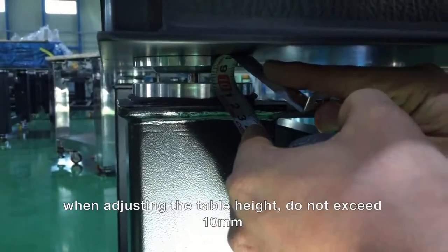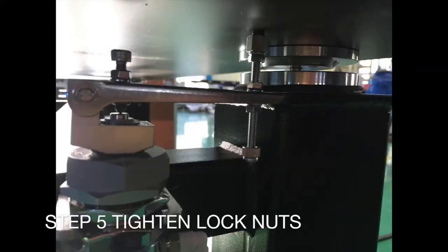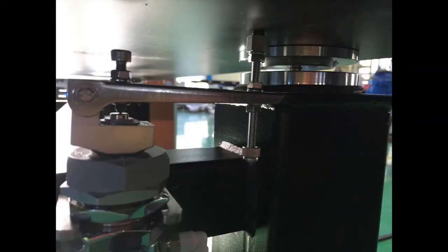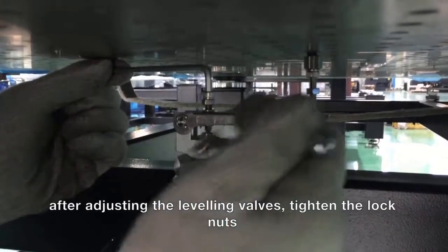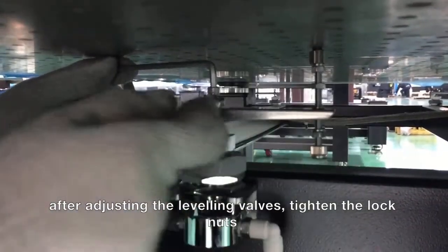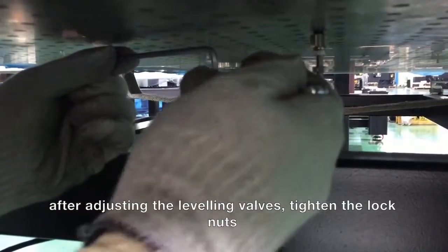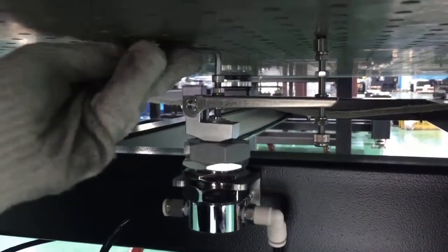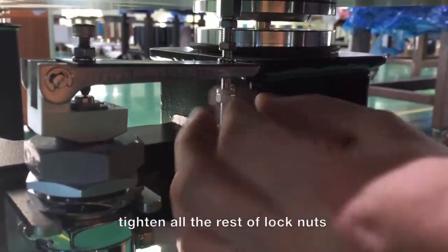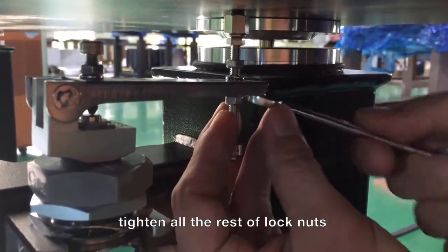Be careful when adjusting — do not exceed the maximum length of 10 millimeters. Step 5. Tighten the lock nuts. After leveling the table, tighten the lock nuts so that the screw position can no longer be changed. Tighten all other lock nuts — the table can be put into operation.